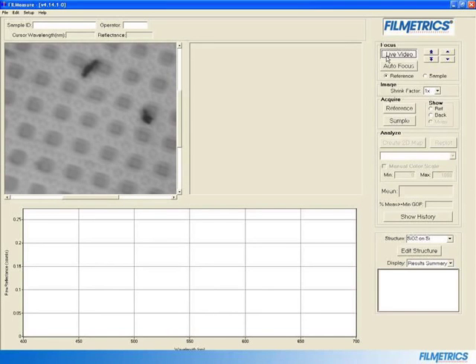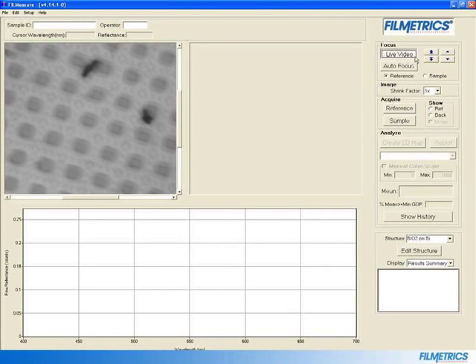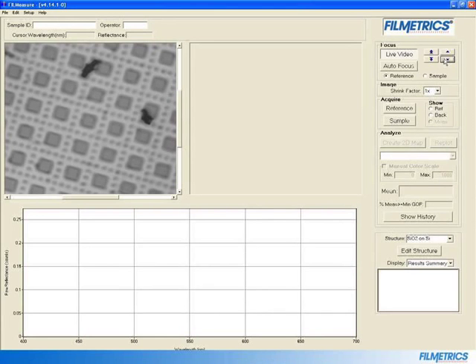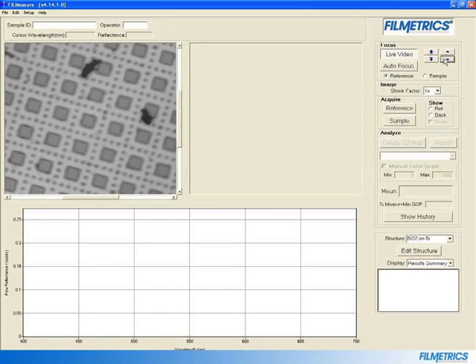Click on the reference radio button if it is not already selected. Then click on the up and down arrows next to the Live Video button until your image is in focus. The double arrows will move the stage arm of the system up and down quickly, while the single arrows can be used for fine adjustments.